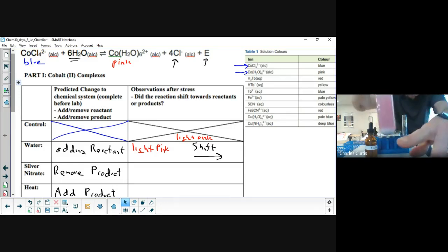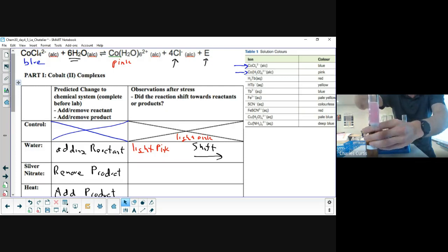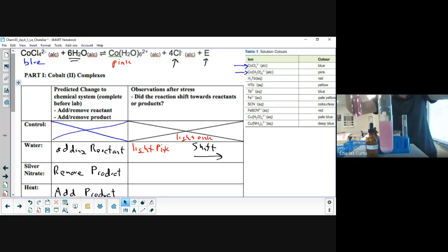You can pretty clearly see a whole bunch of white precipitate at the bottom. That's not the color I care about. I care about our equilibrium mixture. And this one is even darker pink. I'll grab my control again. There's a very distinctive difference. This looks even more purple now, the control that I'm moving up and down. And the forward one is our reaction. Definitely pink now, no purple at all. So it's definitely shifted towards the products.